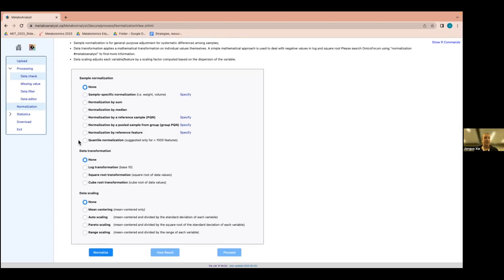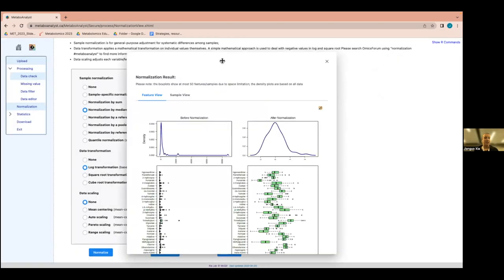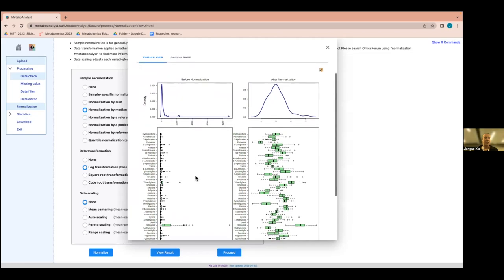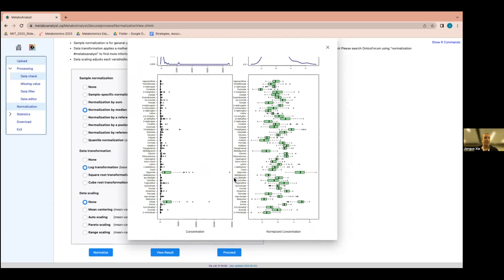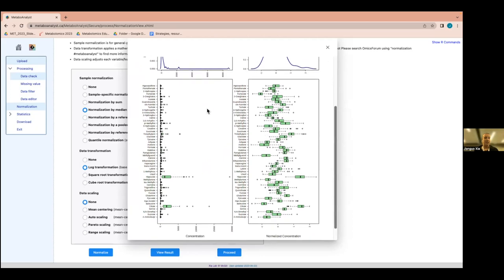There are three sections on the normalization page: normalizing samples to make overall distributions comparable, data transformation, and scaling. The most common transformation is log transformation, which is usually necessary so features are roughly normally distributed. I almost always select normalization by median and log transformation. Before normalization the distributions are very right-skewed; after applying log transformation they're all approximately normally distributed. It's also a good idea to click 'view result' in case your data was already normalized before uploading — you don't want to double log-transform.